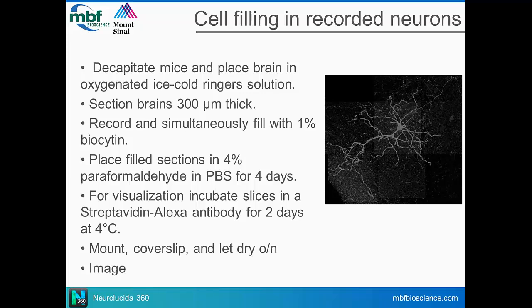I think that's really strong and really powerful data. And again, you just simultaneously fill the neuron as you're recording and then take your slice, fix it in paraformaldehyde, and then visualize your cells by doing an immunohistochemistry with streptavidin and Alexa antibody.